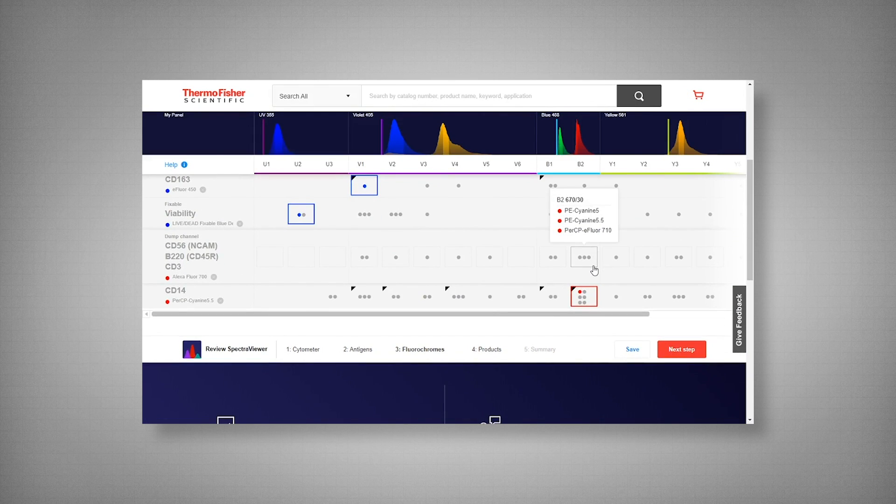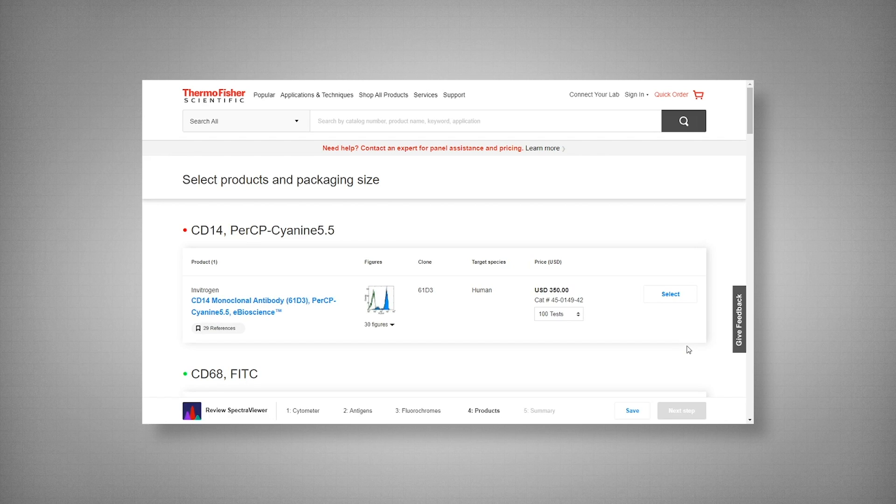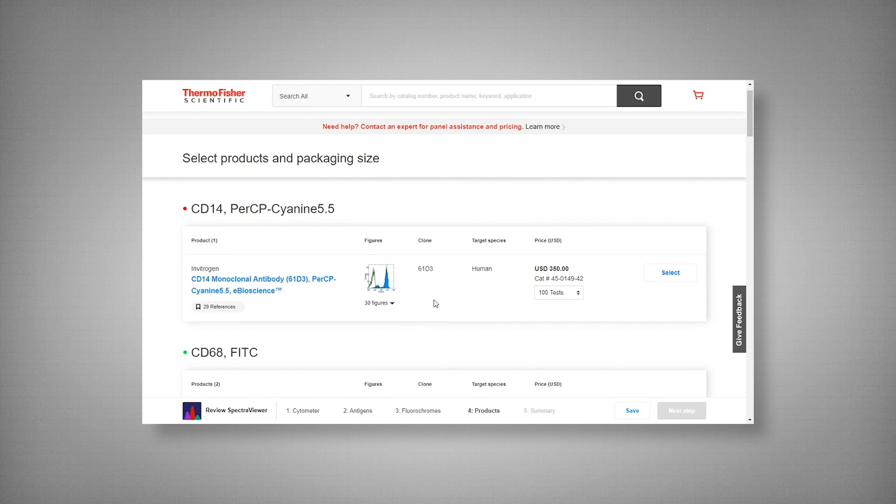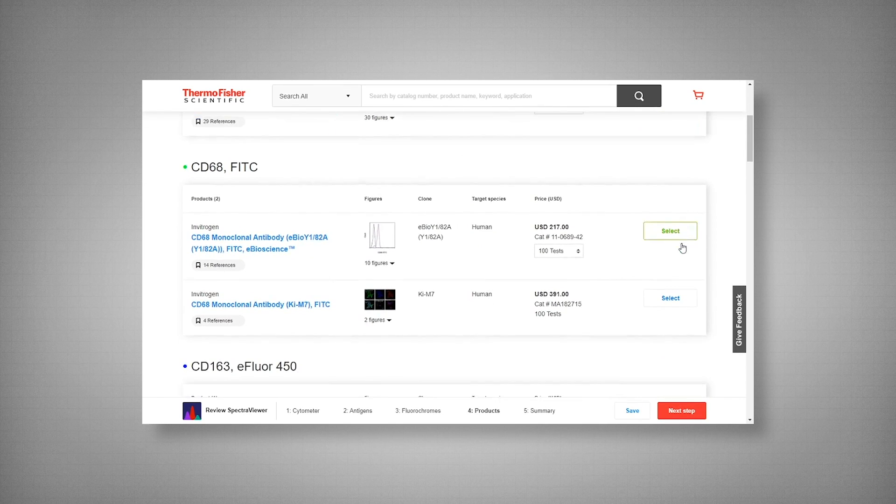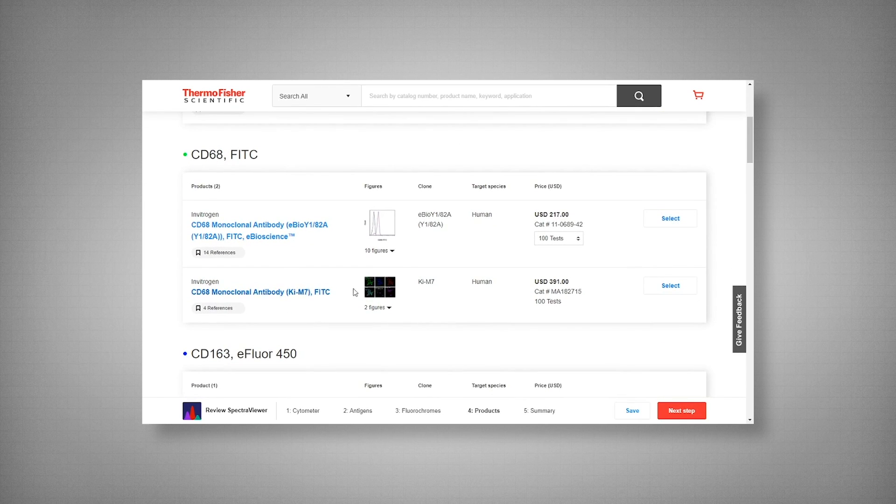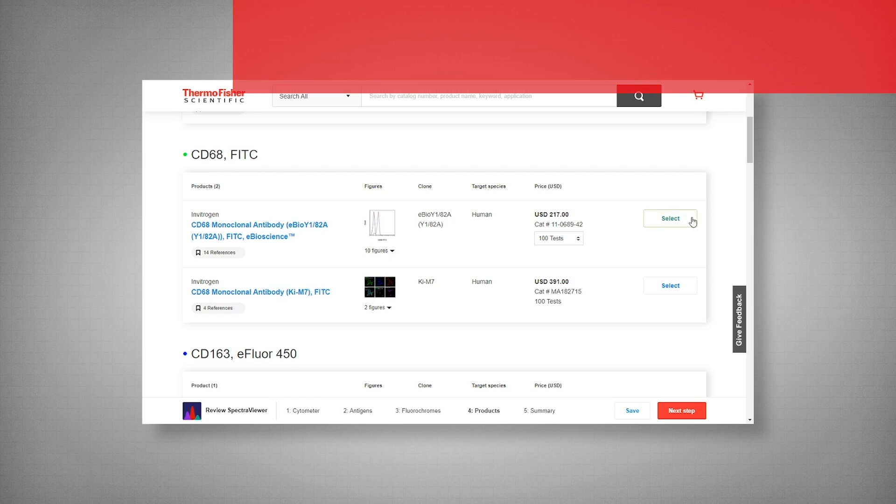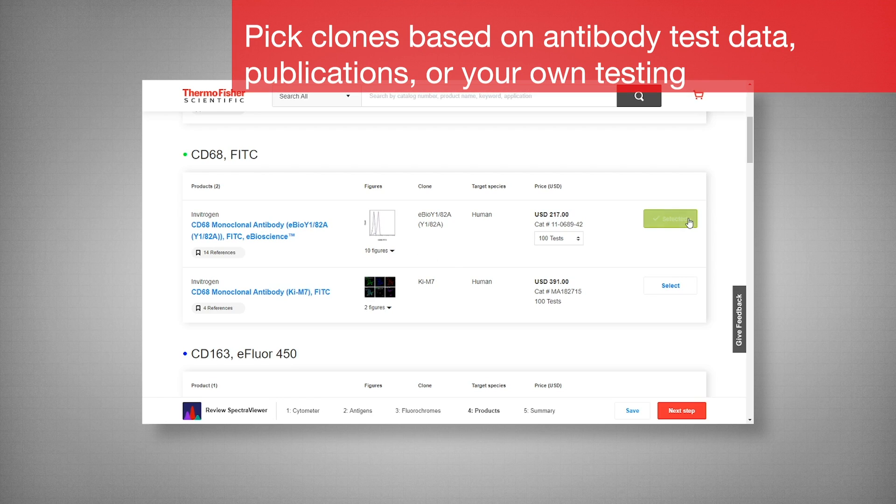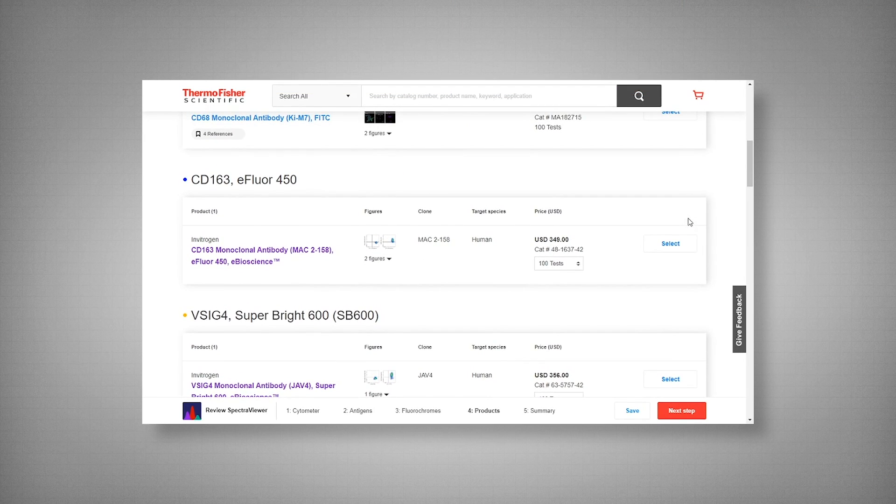Now our next step is selecting antibody clones. Now some targets will have multiple clones available, but not all. So here we have clone 61D3 for one of our phenotypic markers. Now here we have two clones available. We have eBio Y1-82A and KI-M7. I personally do like this clone. I've used it a couple times.